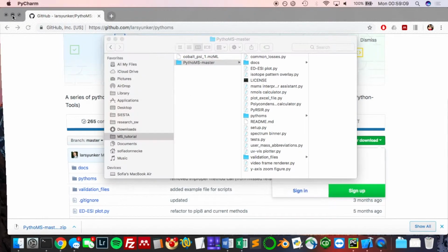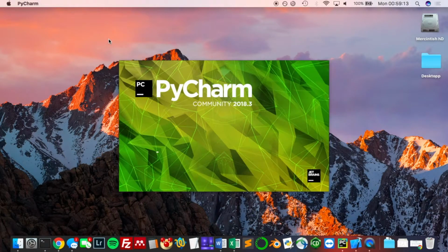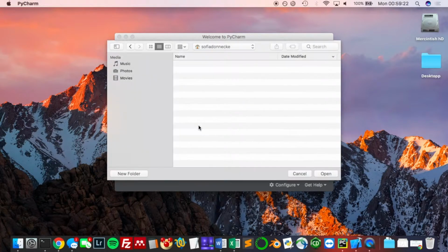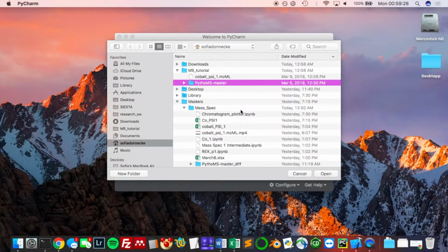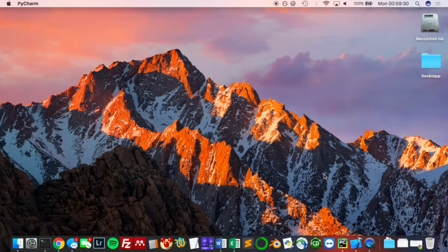Alright, so I'm going to go ahead and open PyCharm, and great. Alright, and you're going to hit open, and you're going to find your PythoMS master folder.